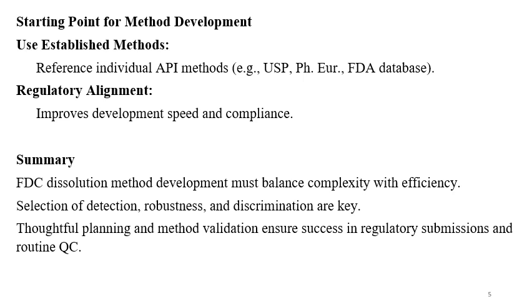So whenever you are working on FDC method development, understand the sink conditions, understand the release mechanism of the formulation, understand the BCS class, and then you can go for the method development.